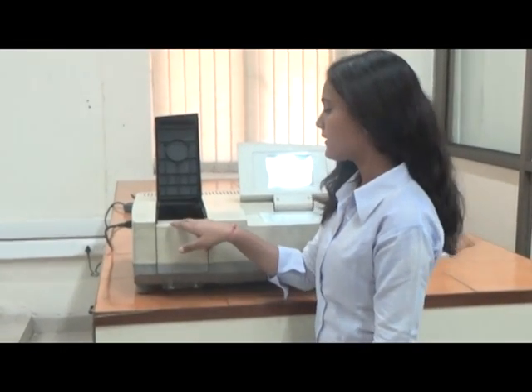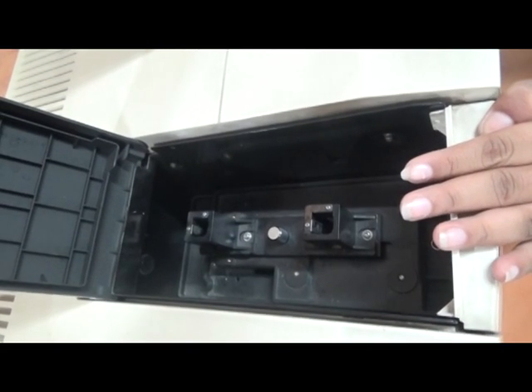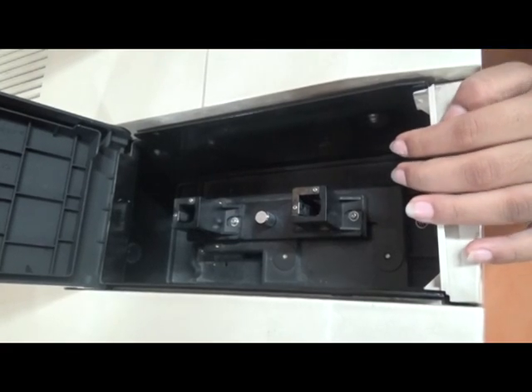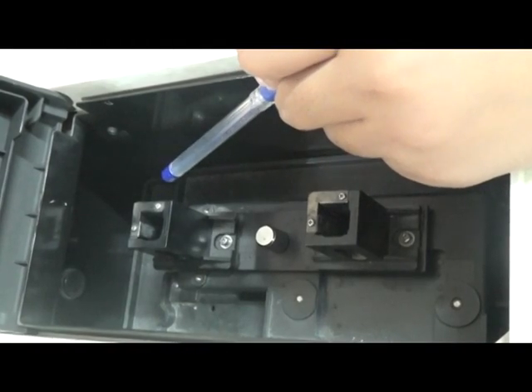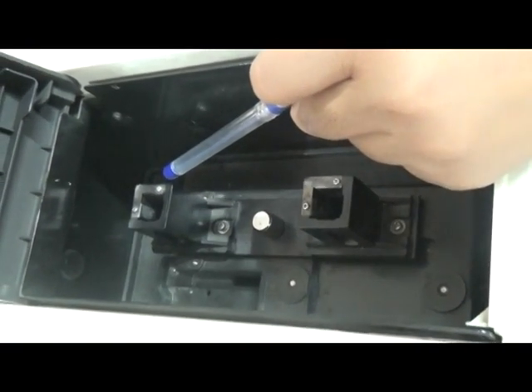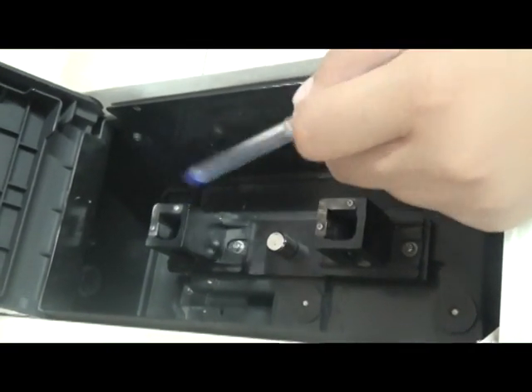This is called the sample compartment. I will tell about this part of the spectrophotometer. This is the component in which the sample being measured is set. Cell holder: the cell holder for the rectangular 10 mm light path cells has one sample cell holder and one reference cell holder.